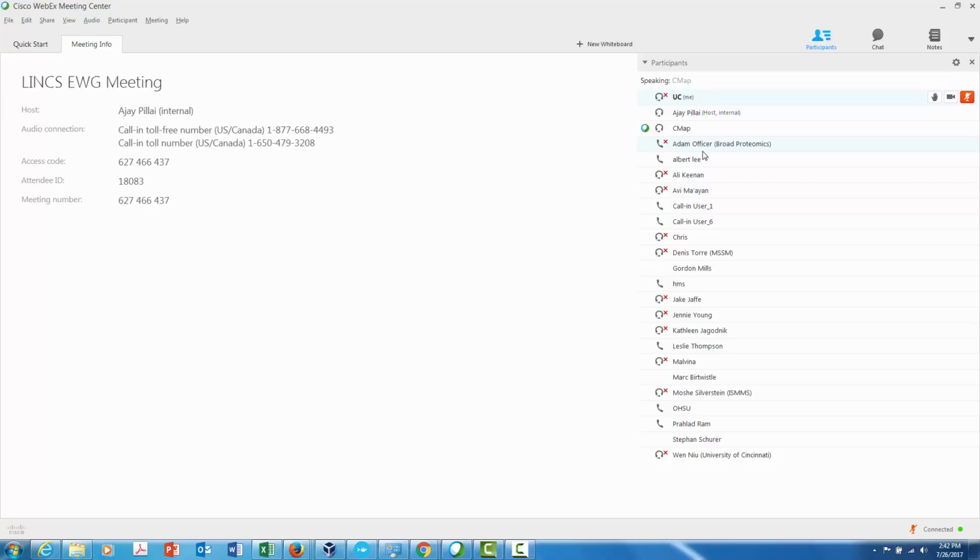Did you guys use a lentivirus to try to do that? You mean like making them stably express Cas9? Yep. Yes, we did. This is Mark from Sunlight. Every time I've tried to make a stable cell line with 10A without a lentivirus, like by transfection or some other means, or flow sorting even, I tend to get that same result where they just don't like it at all. So that's why I was curious if you used lentivirus or not. Yeah, we did. It's good to know it's not just us.